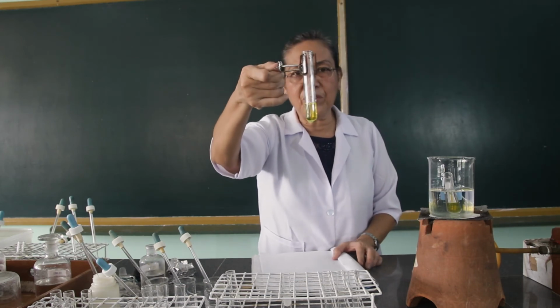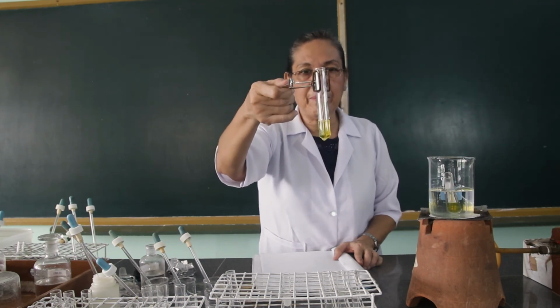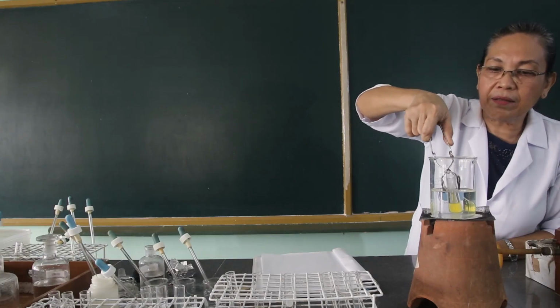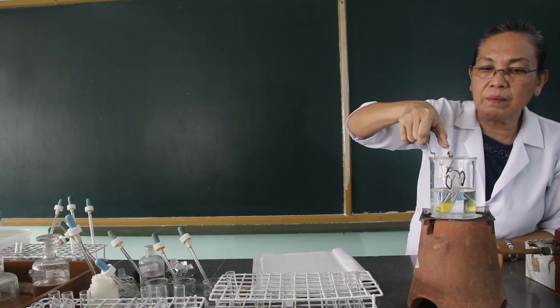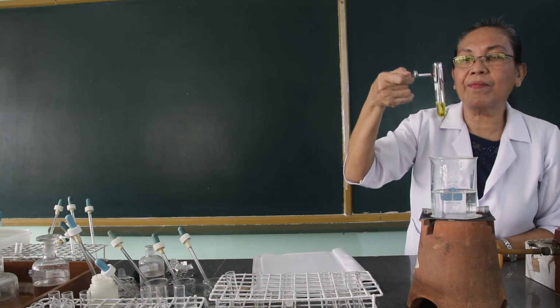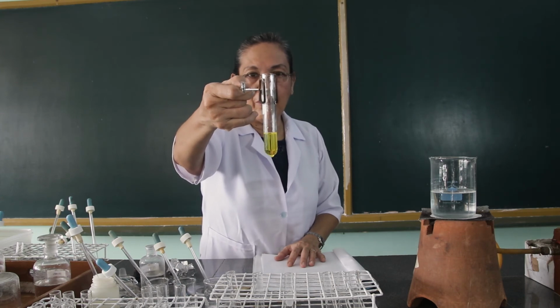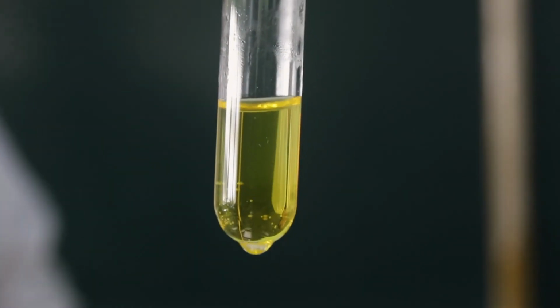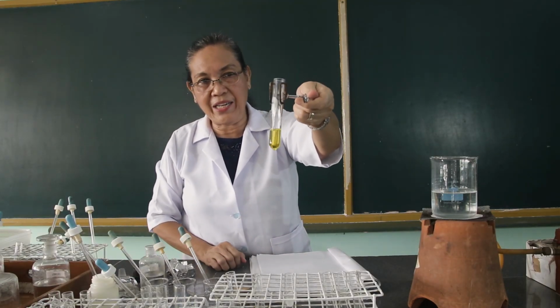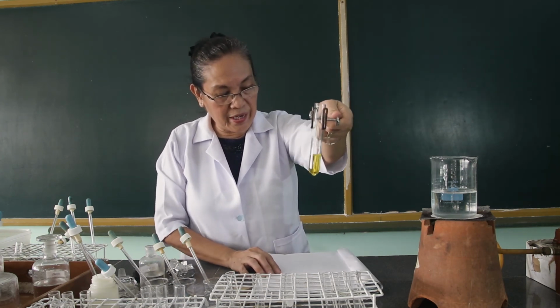So this is the strontium, which is added with ethyl alcohol, then placed into the water bath. Observe what happens. And this is the calcium added with the ethyl alcohol, then placed into the water bath. Observe. So this solution, which is actually calcium, did not form a precipitate, so let us proceed to procedure letter F.